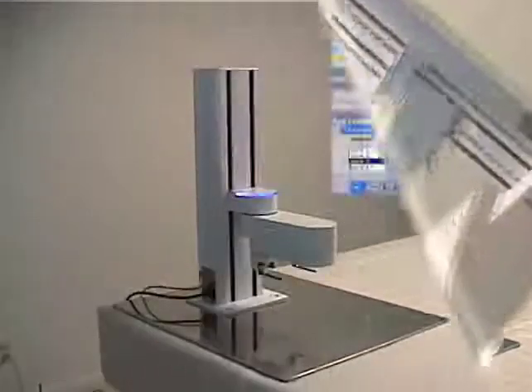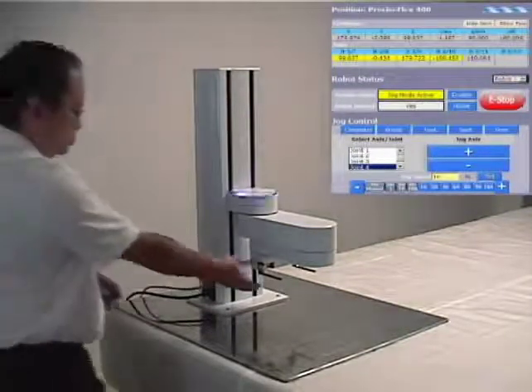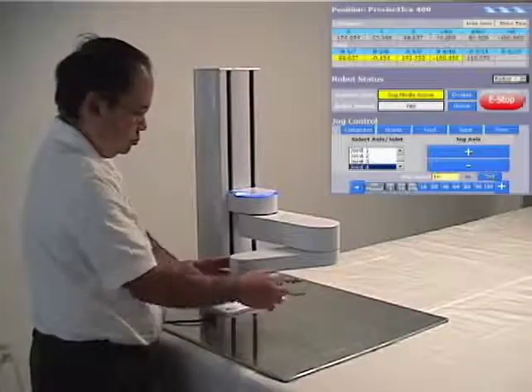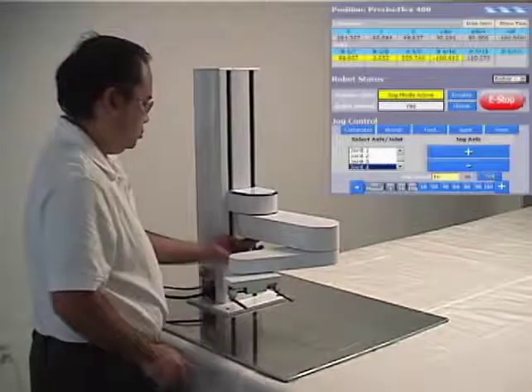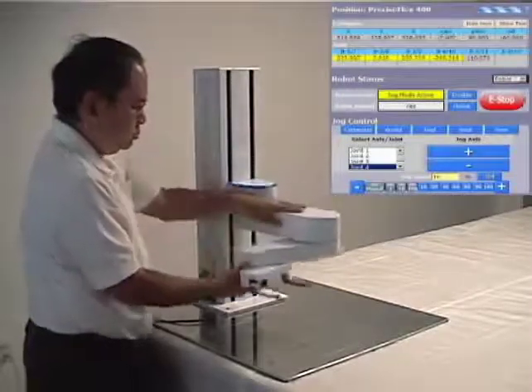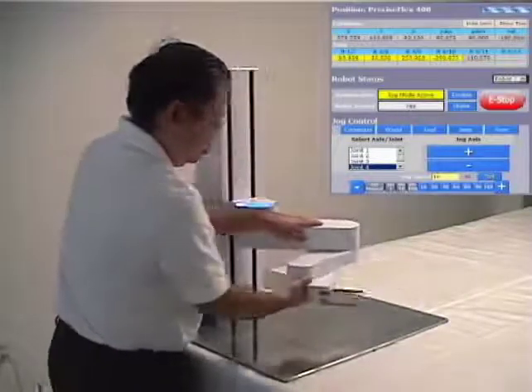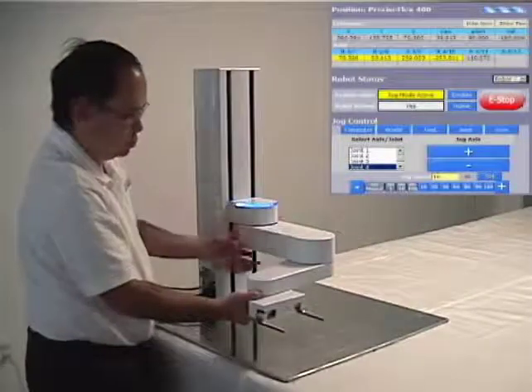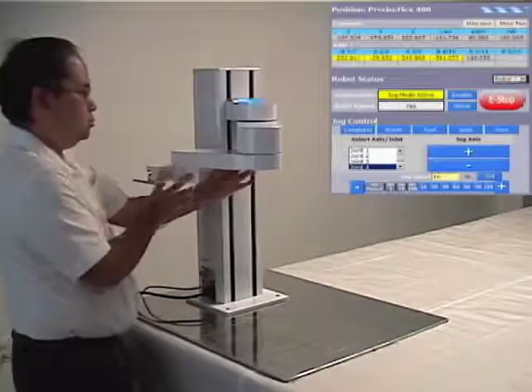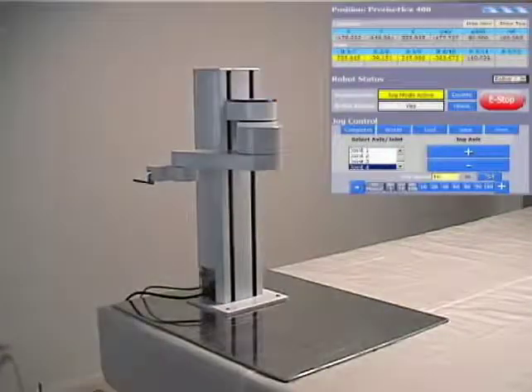Programming motions is easy. The robot can be placed in a gravity balance free mode that allows you to freely move the robot around any of its axes of motion. You can see the position of the robot being updated in the pendant shown in the corner of the screen as we move the robot around in free space. Any position you can move the robot to can be saved into memory, and using the kinematics found in every Precise Automation controller, straight-lined and blended motions can be automatically generated between any of these points.